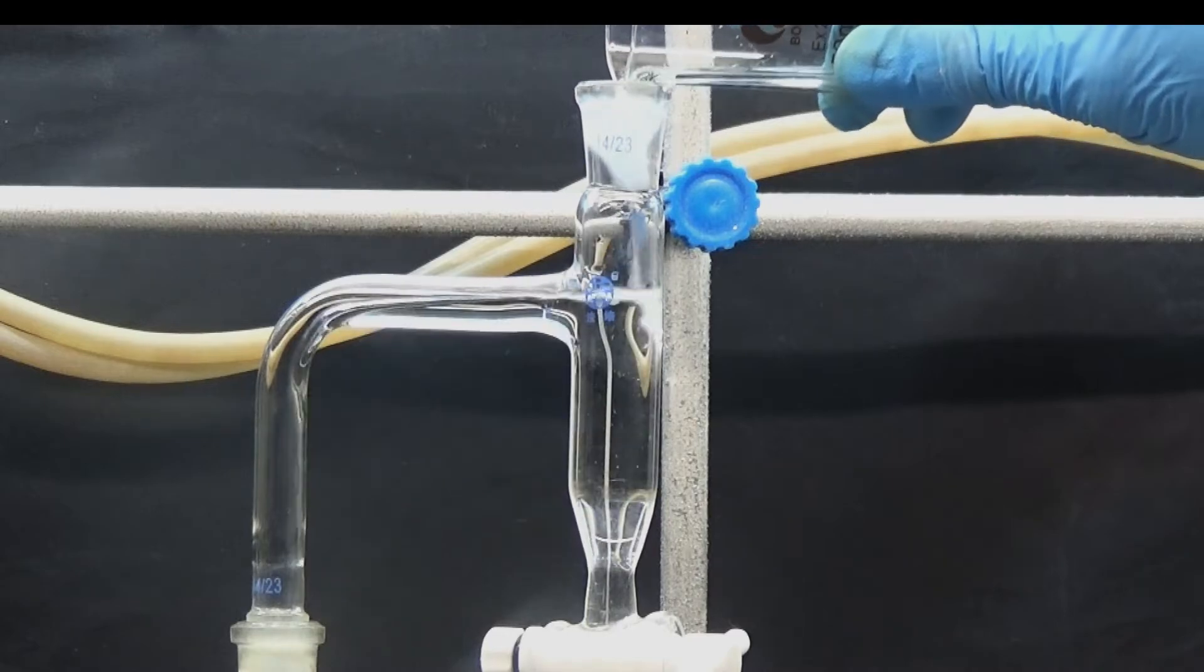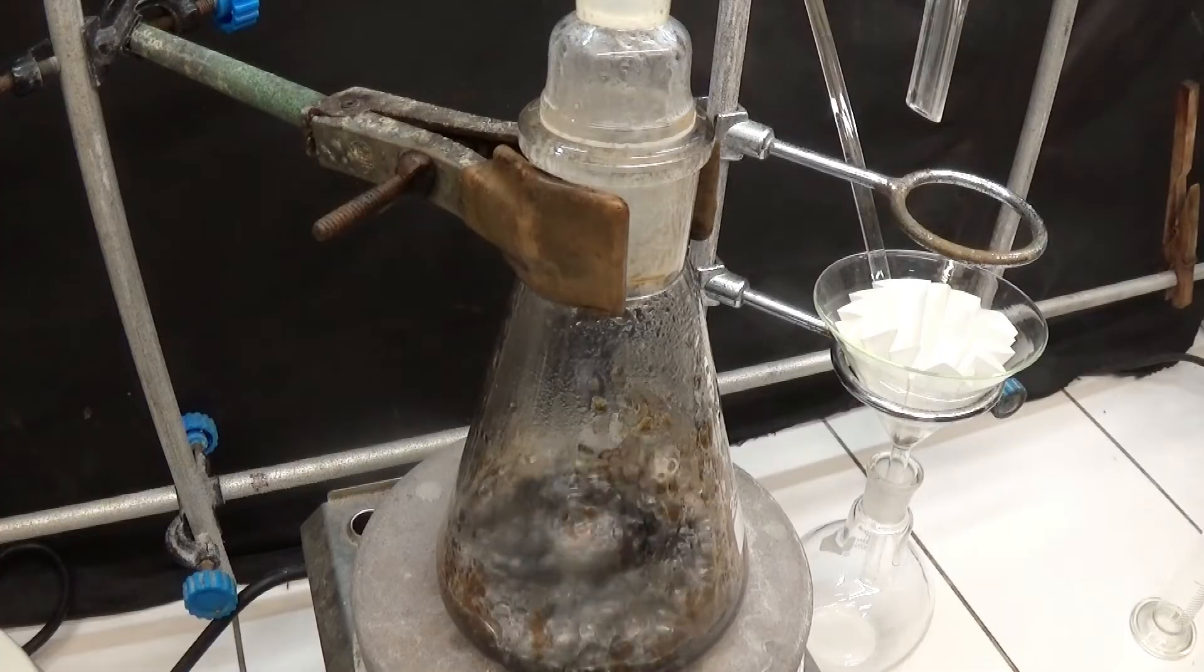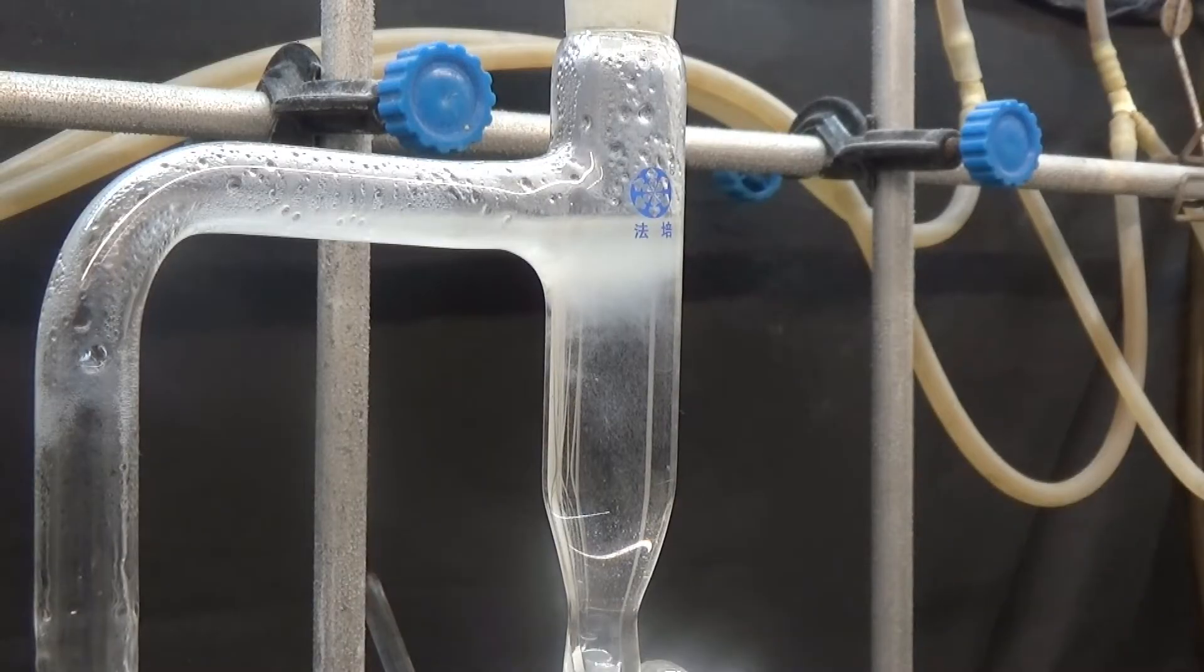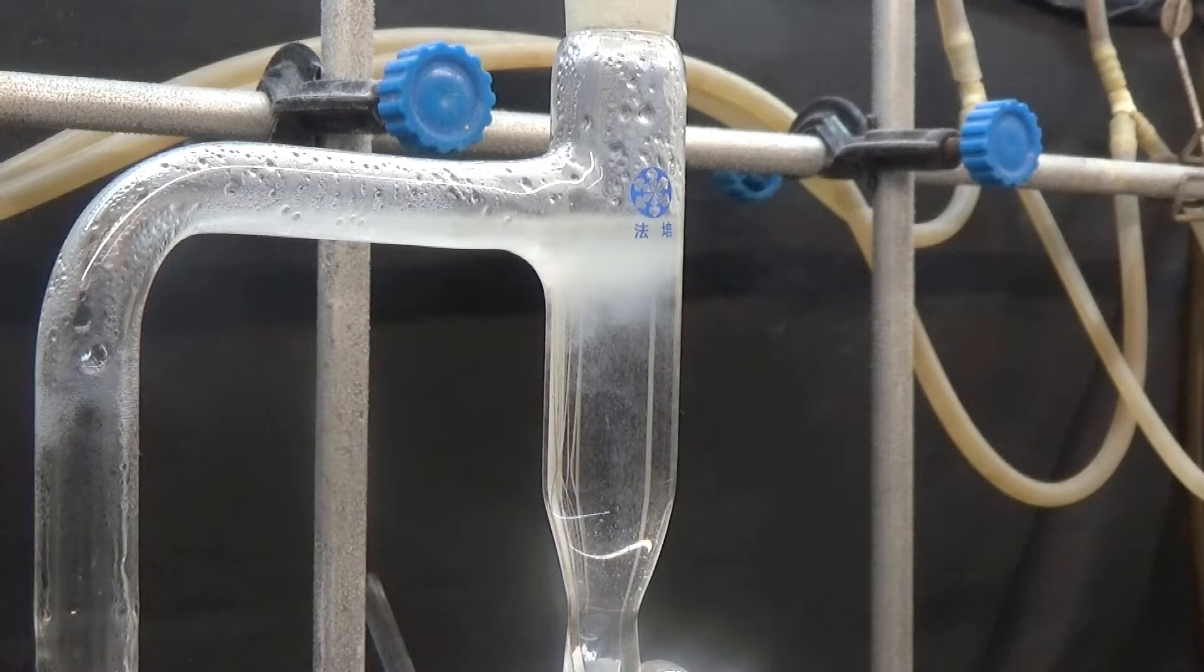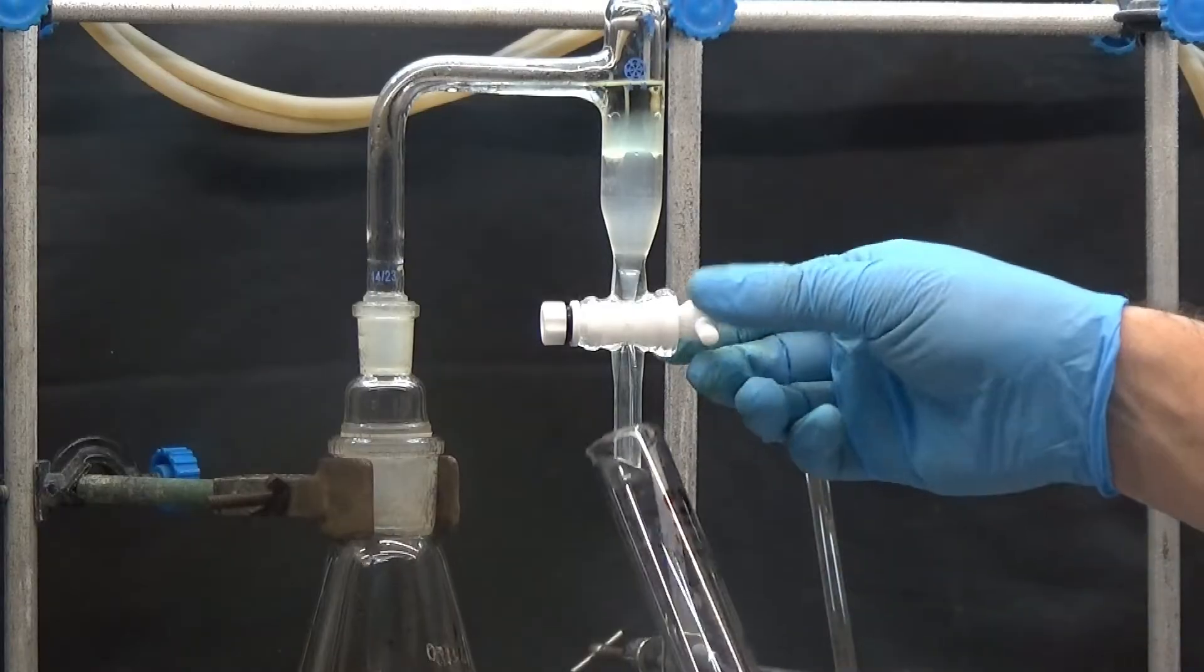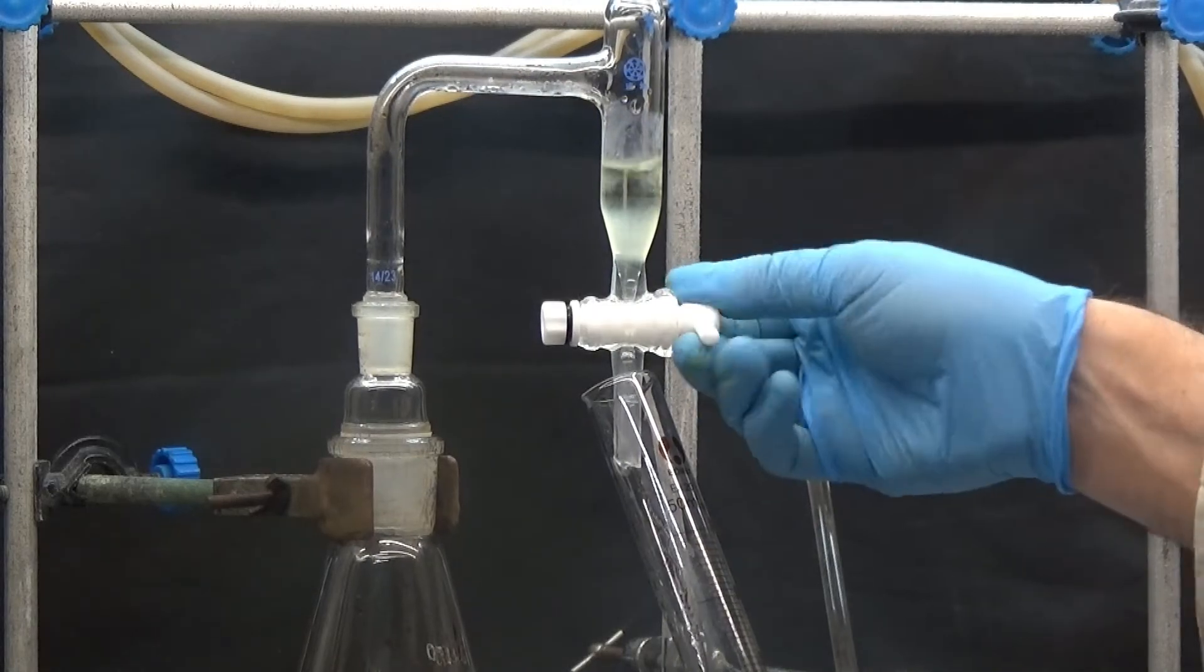Assemble a Dean-Stark and fill with 25 milliliters of toluene. Heat the flask to distill the toluene-water azeotrope. Remove the distilled water that separates in the Dean-Stark. Distill until no water drops are observed.